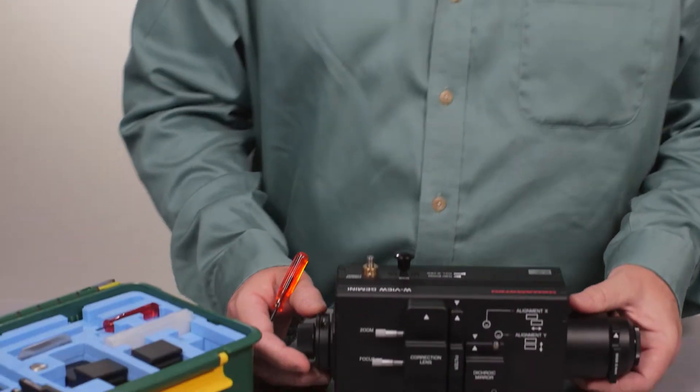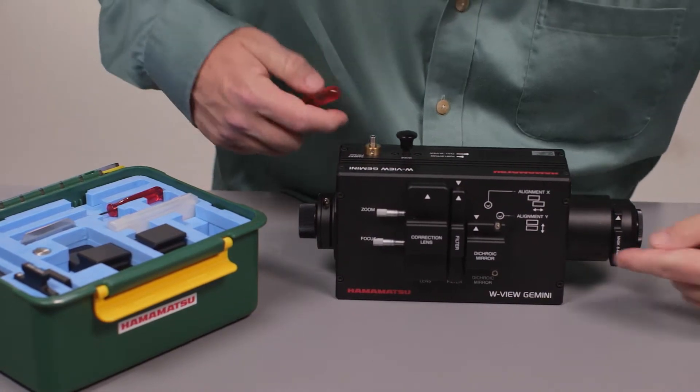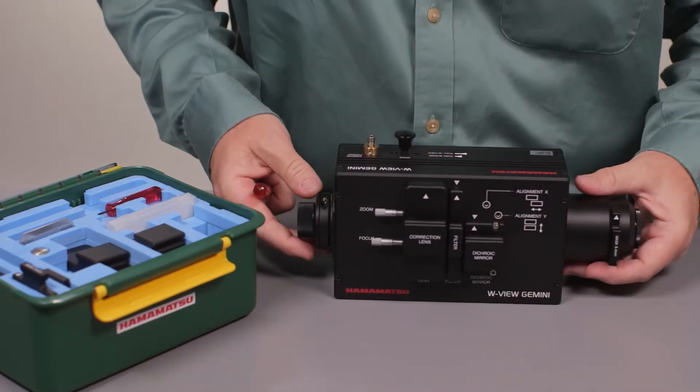I'm Jim Sims with Hamamatsu Corporation, and this video is Bypass Mode Explained. Normally you're going to be using the Gemini to do split imaging. Light's going to come in, hit the dichroic, take two different paths, and you're going to get two different images.